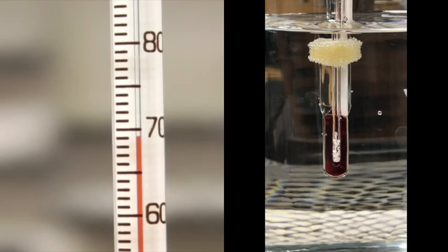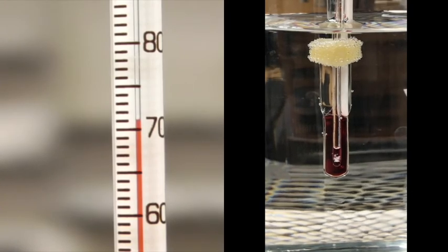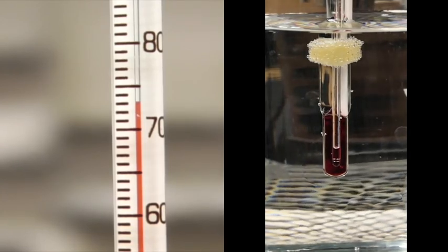Oh, you're starting to see it melt. There you go. So you should bring the temperature down now. You're looking for when it's all liquid. Still a little bit of solid in there. Okay, it's all liquid right there. Okay, so those are your two temperatures, when it first starts and then when it's all liquid. So we got a pretty big range there.